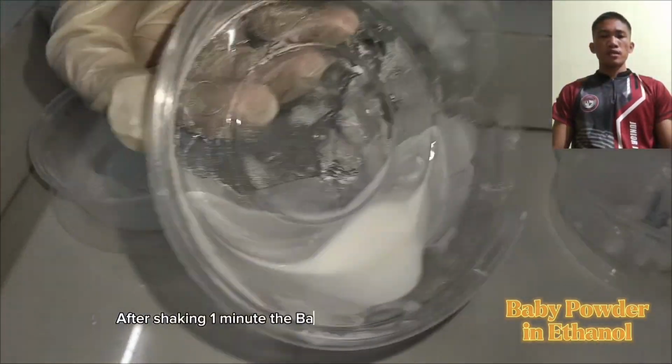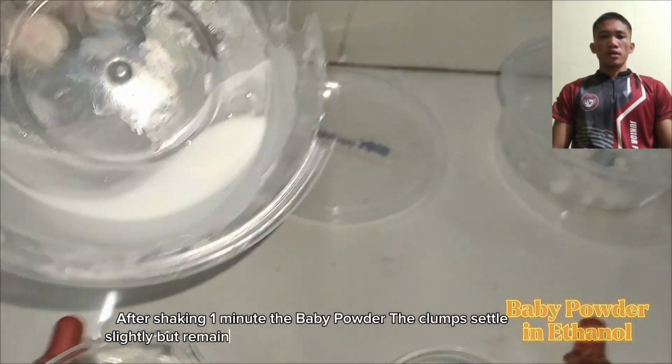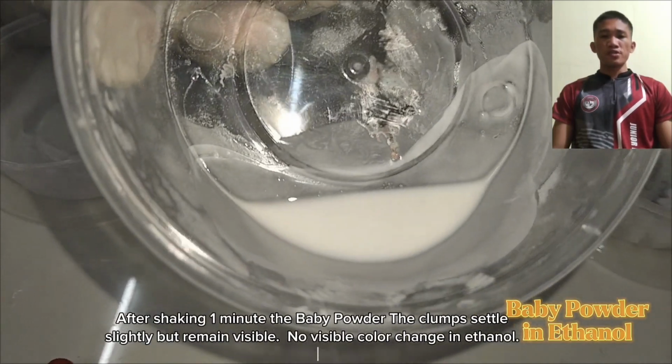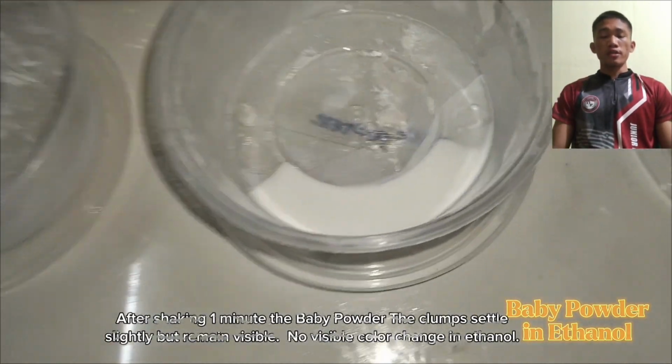After shaking 1 minute, the baby powder clumps settle slightly but remain visible. No visible color change in the ethanol.